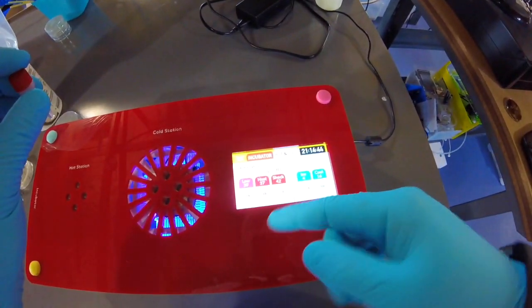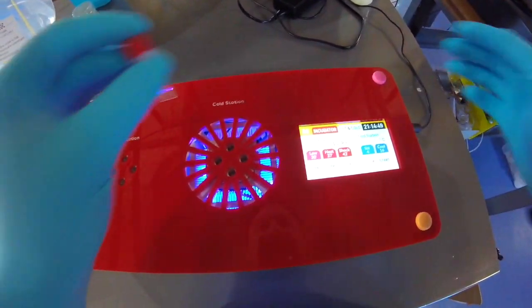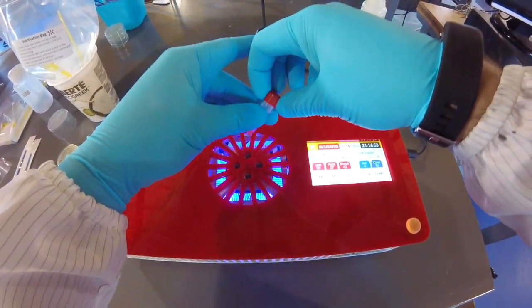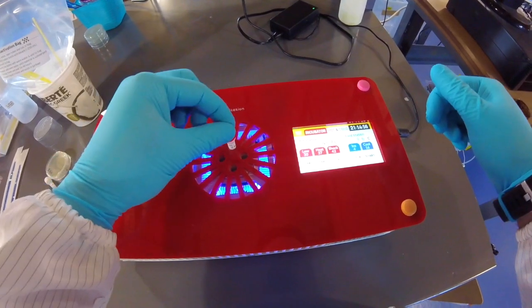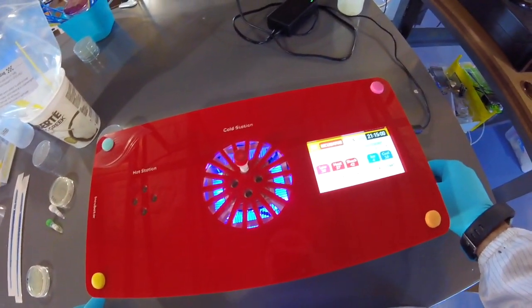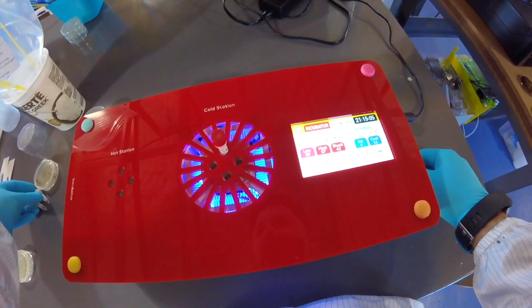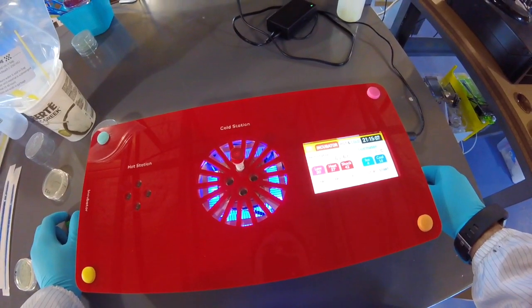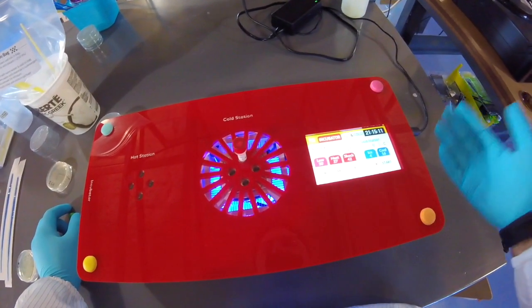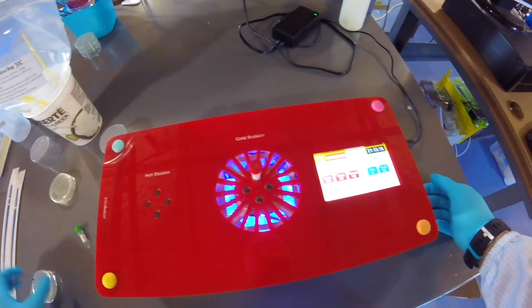If the hot station is above 42 when you're doing the heat shock by a degree or two, it's not a big deal. You can just go for it. All right, so you need to put your transformation buffer on the cold station, okay? So you're going to put it in there, and this is to cool the whole reaction down. There's a lot of salt in there, especially calcium chloride, which can be harmful to cells. And so you want to cool it down to help the cells survive a little bit better, all right? And so that'll help preserve the cells.